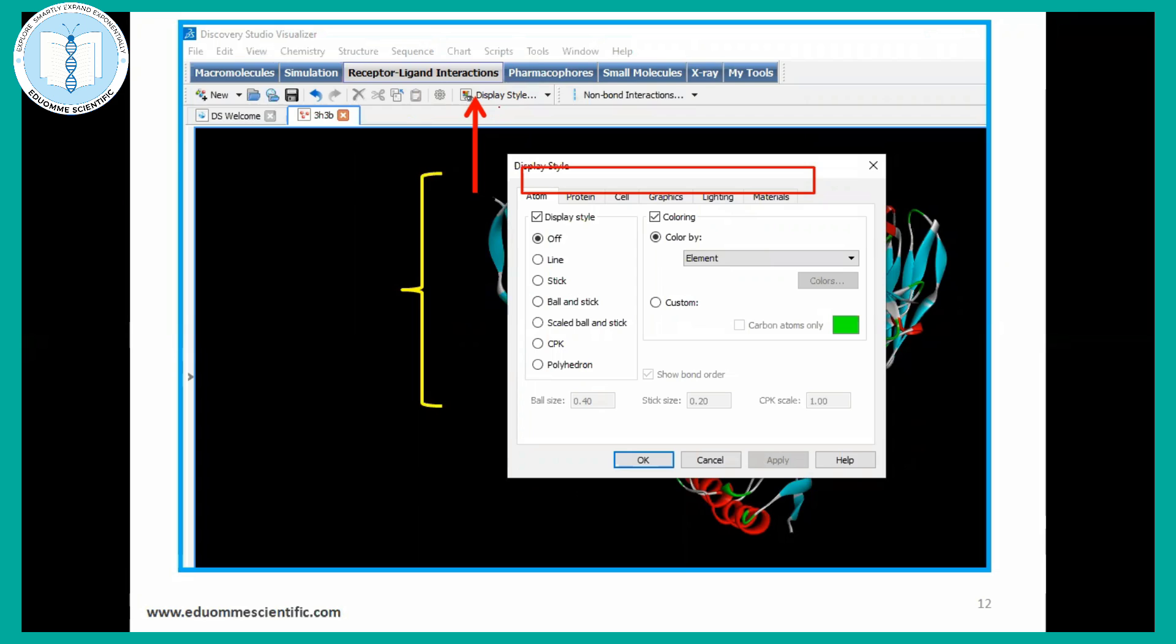If you will click here in display style also, there are different features also like actions. For publication quality, if you want to change the background, lighting, graphics, or different settings, you may select these features from here. If you want stick format, ball stick, or CPK model, then you can get it here. And the color coordination also, you can change. The background also you can change.